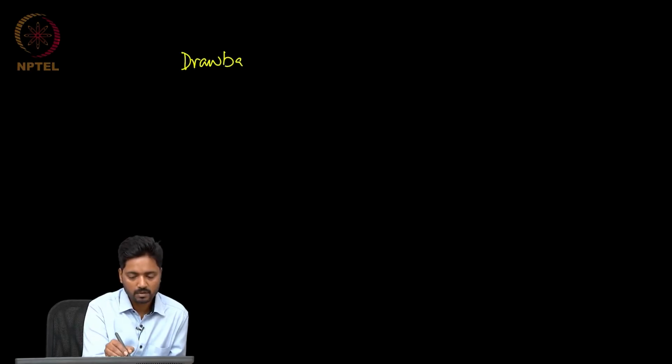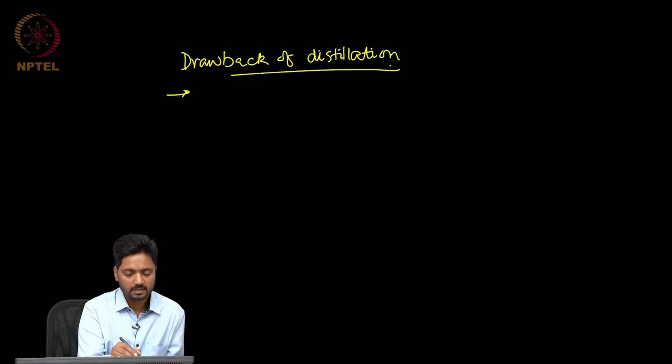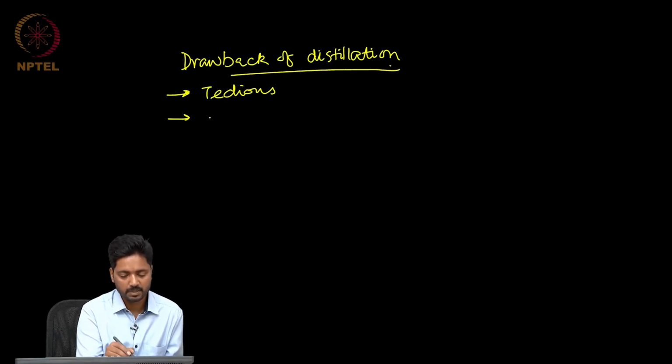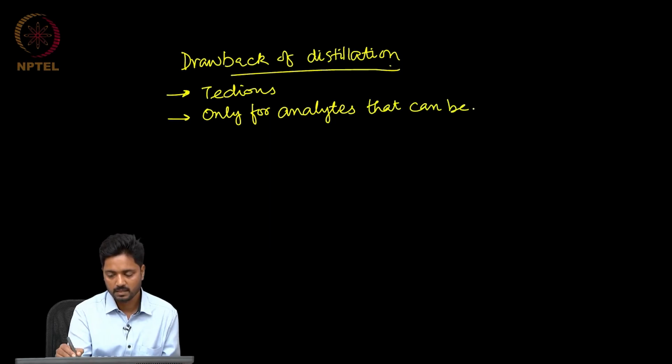drawback of distillation, we observe that it is of course a tedious process and is amenable only for solutes or analytes that can be easily vaporized.